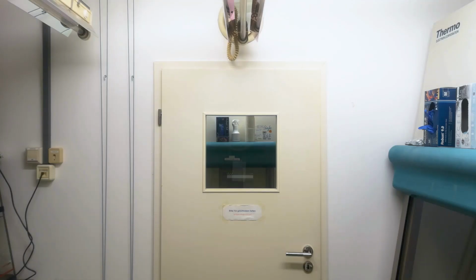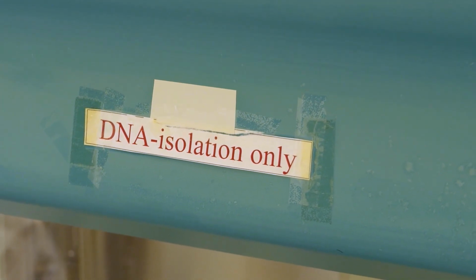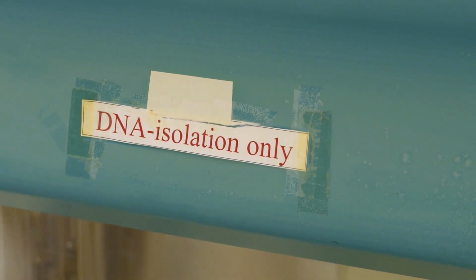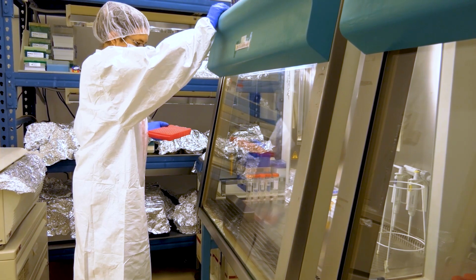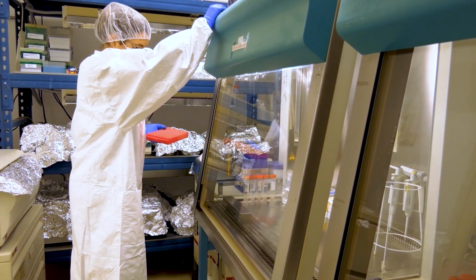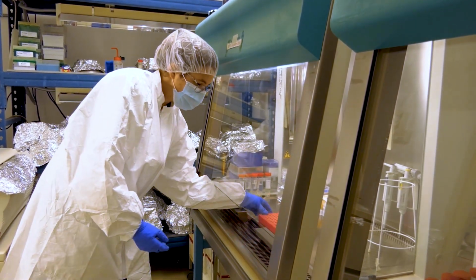At this point, we change from the grey room to the cleaner white room at the back and make sure to handle samples and lysis products in different hoods, as air-floating scales of previous samples may otherwise lead to contamination. Change or decontaminate your gloves after every sample and/or after every step in the protocol.